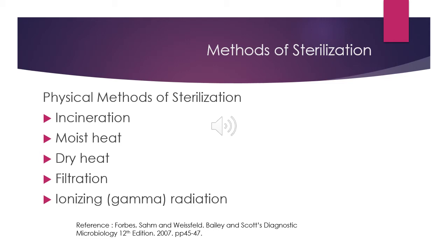The next one uses dry heat, accomplished by a high source of dry heat, which is the oven, and usually entails long contact time for things that you need to sterilize.